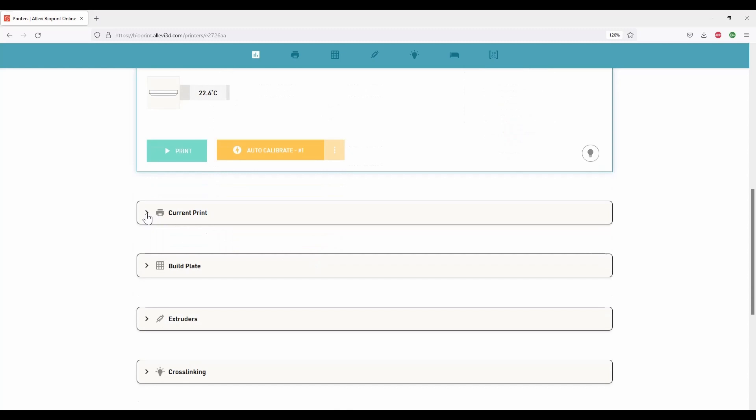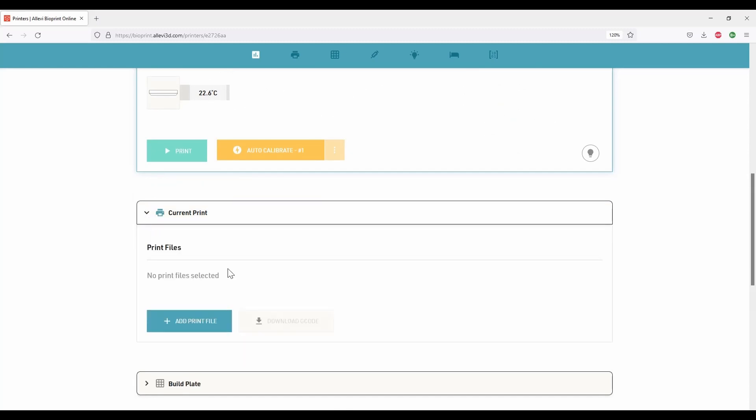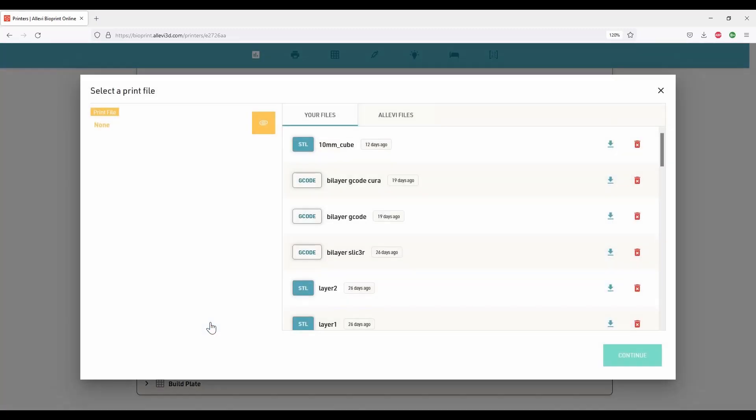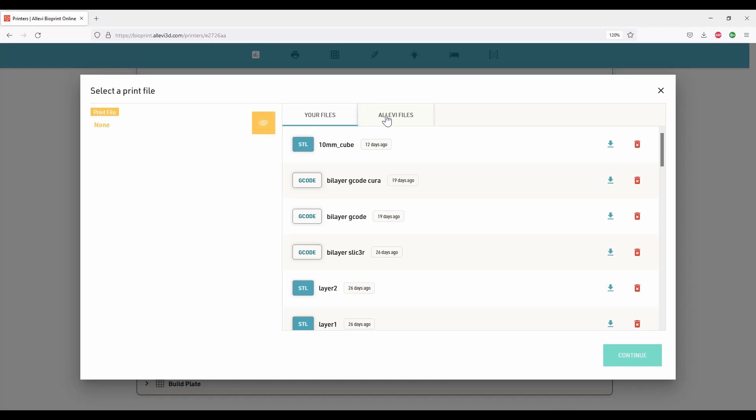Under current print section, we can upload STL file or a G-code file of the model to be 3D printed. Click on the attachment icon to upload desired file by browsing to your computer, or you can choose a default model under Alevi files. In this demo, we will be 3D printing a 10 millimeter cube.